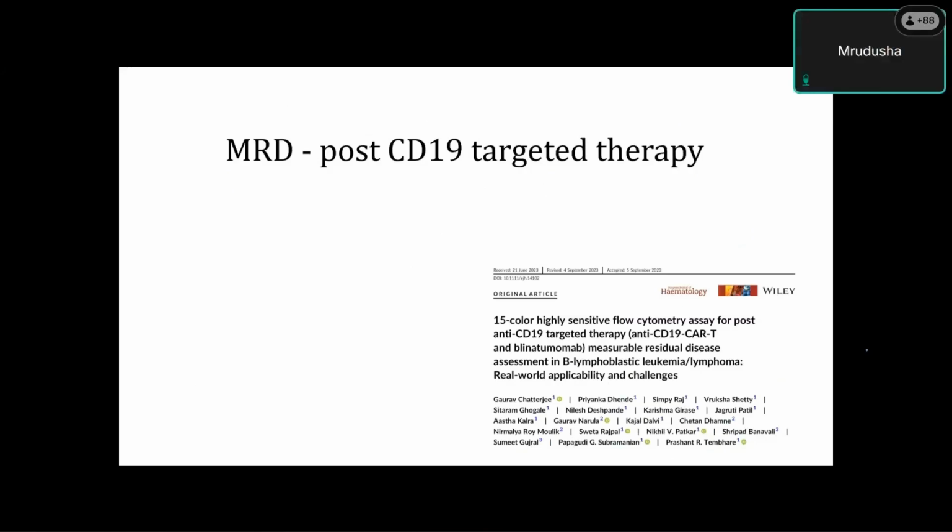The first question is, in the earlier graph, the early immature B cells were labeled as CD19 positive and CD20 negative. The first figure you are talking about, right? The one from the Henry's book.